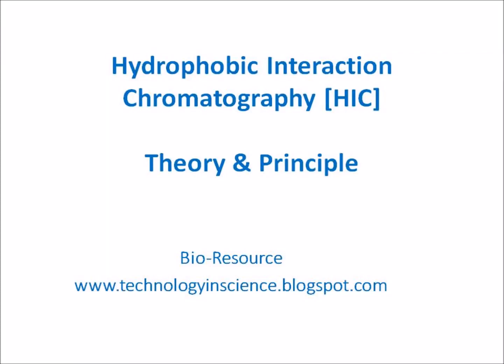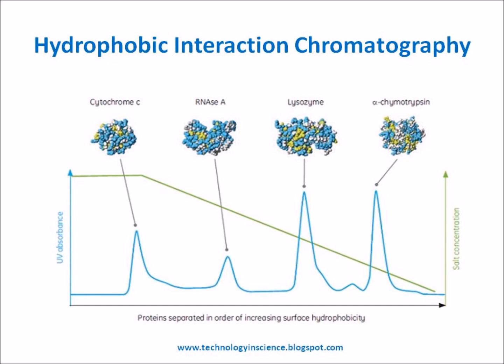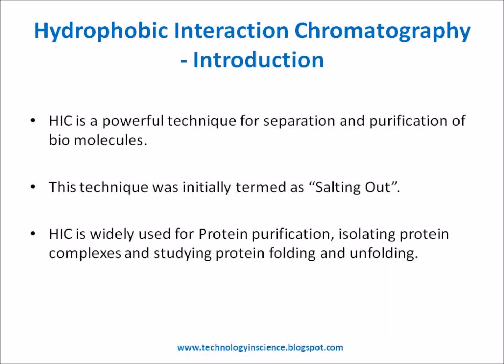Hydrophobic interaction chromatography, theory and principle. Hydrophobic interaction chromatography is a powerful technique for the separation and purification of biomolecules. It is widely used for the separation and purification of proteins in their native state, as well as for isolating protein complexes and studying protein folding and unfolding.